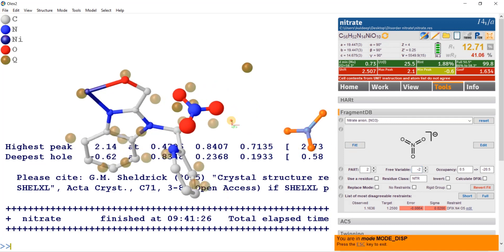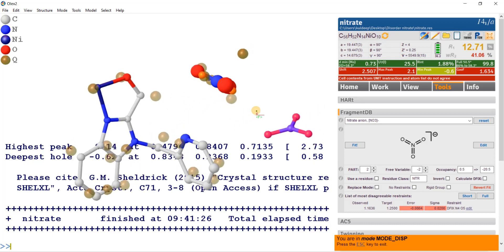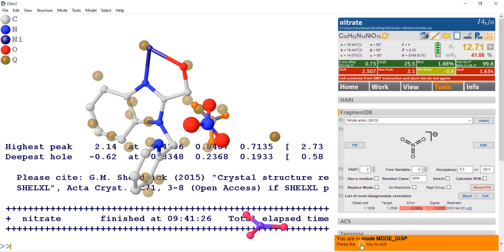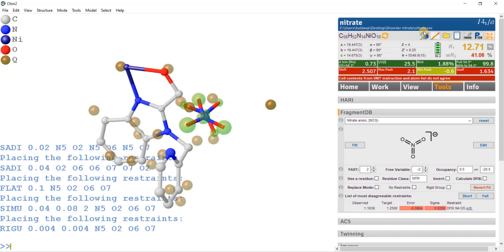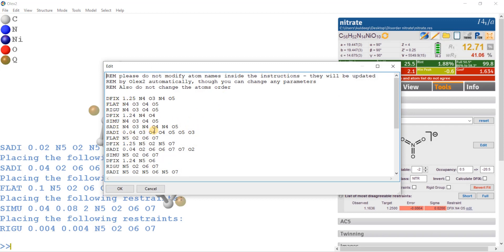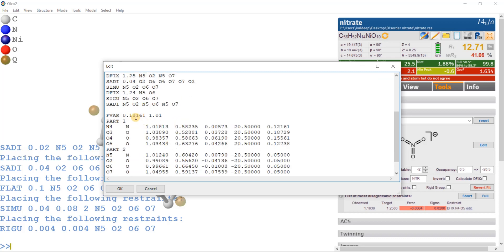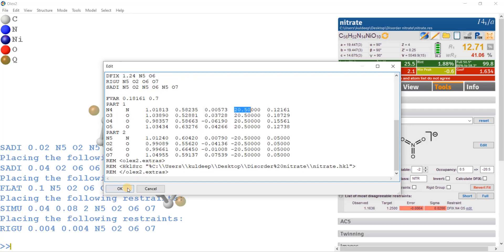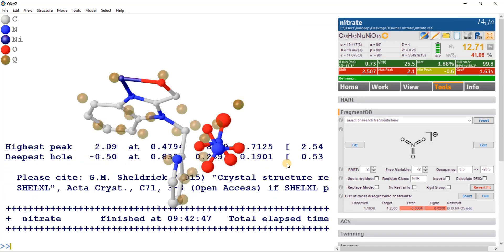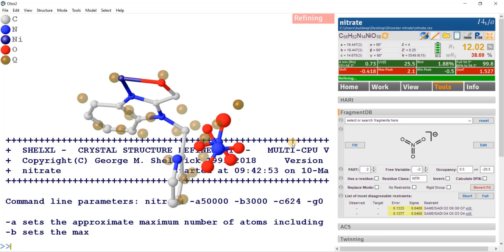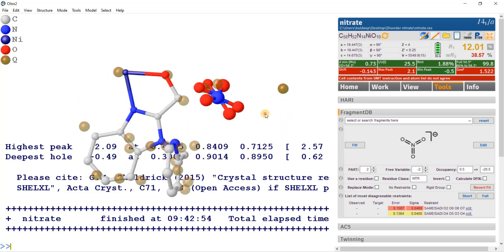Escape. Selecting these atoms and pressing the button — you can see all the restraints and constraints are already written automatically. Using the second free variable with initial value around 0.7: PART 1 is 20.5 and PART 2 is minus 20.5. Refining with Control R — it is settling down nicely. This peak should be oxygen with half occupancy. Assigning it as oxygen, then refining — the R factor is getting down, the shift is stabilizing. Refining one more time.